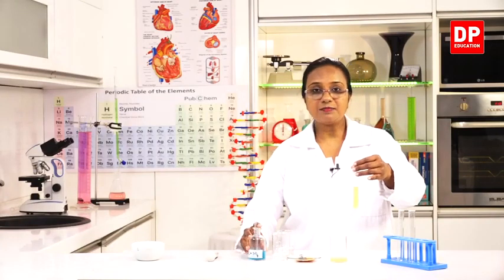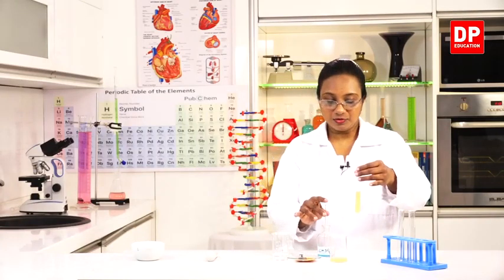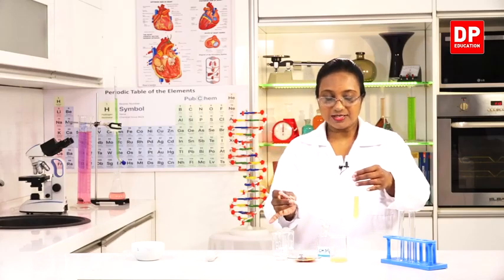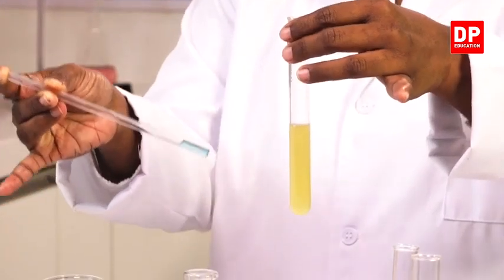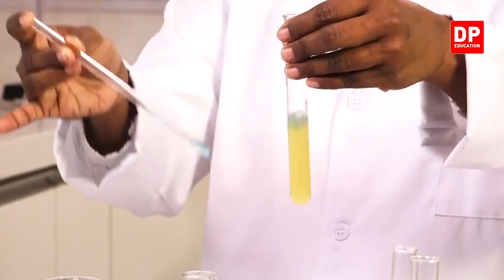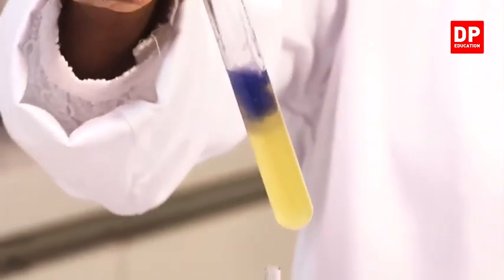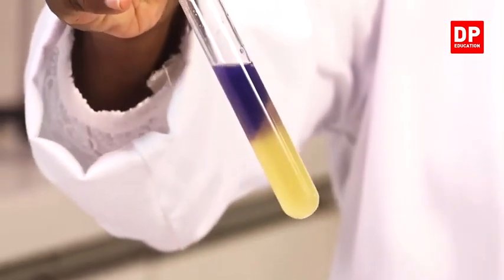Now, to this mixture, I will be adding a few drops of the blue color copper sulfate solution. Now, observe clearly what will happen. You all can see a nice color change, the appearance of a purple color.